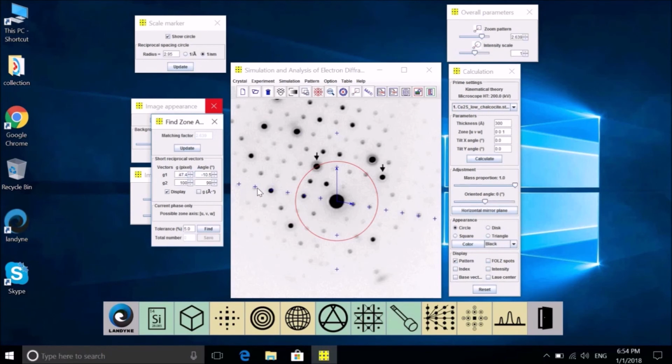Yeah, this will be my best fit. All the markers are filled in this line. So we find that the second line will be to this one. So then I decrease my angle. Increase a little bit. A little bit. And this value now is 100, is about 50 here. I can put 50 here. Increase. And now I need to decrease a little bit here. Now is the best fit for this line too.